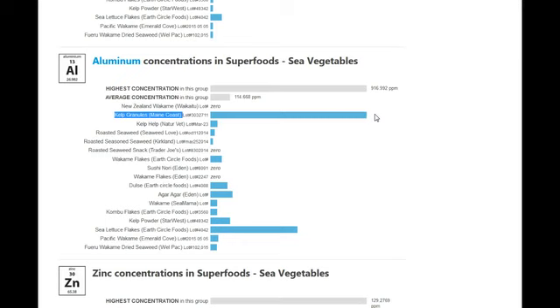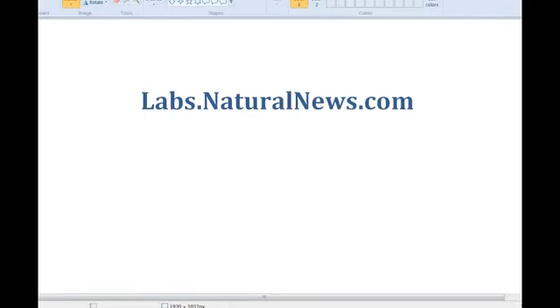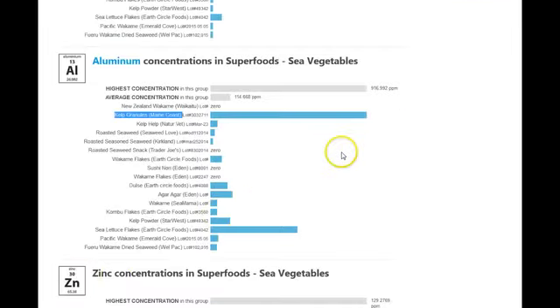And as you may know, if you've been following some of the developments here at the Natural News Forensic Food Lab, which again is labs.naturalnews.com, got to plug that, I'm actually the food scientist who developed the metals retention factor testing methodology and concepts for ICP-MS analysis. So I tested this with the metals retention factor. And what I found is that in this particular case, for this product, and I can't say this is true across other products because I haven't done the tests, but for this product, virtually no aluminum whatsoever is released. I'm talking about probably less than 10 parts per million. It's way down here that actually gets released.